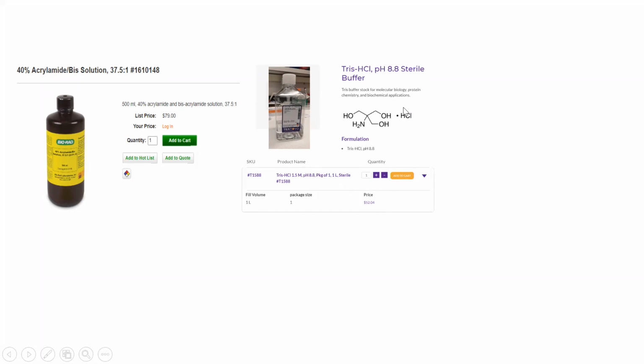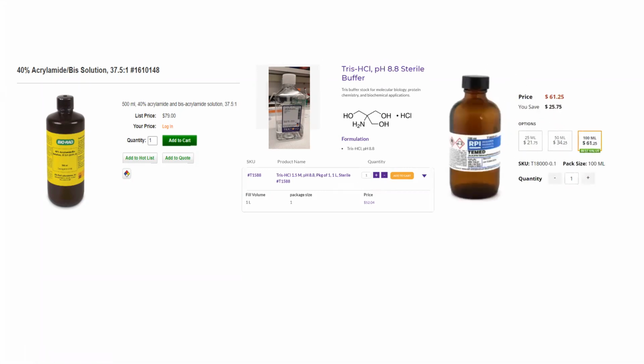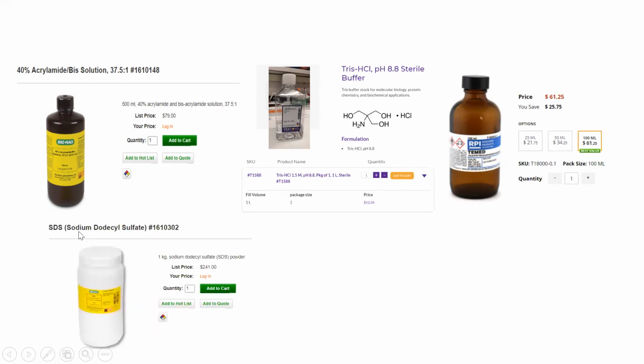Yeah, and then the last 3 components, I guess these are widely used chemicals in every lab, so I guess every lab has them. The TEMED, this is a kind of coagulation accelerator. And another was the SDS buffer. SDS, this is a powder, and normally it can be used for many years, so it costs low.